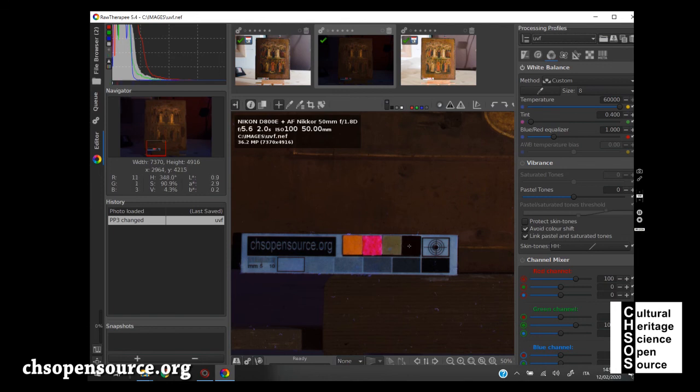And the black over here is a cadmium red, which absorbs the UV and doesn't have fluorescence itself. Okay, so basically these four swatches serve you as controls. So you look at them and you see if your final editing shows them with this actual color. So shellac orange, Madder Lake pink, zinc white yellow, and cadmium red black.